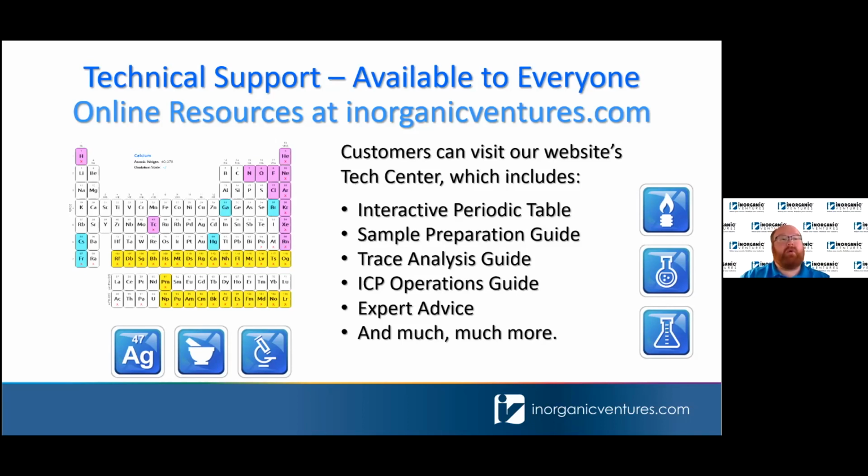But the gold, even gold in nitric has chloride in it. So be mindful of that. There's no gold out in this world that doesn't have chloride attached to it. It's one of those precious metals that just doesn't behave without it. With the bismuth, just increase the HCl and see if that helps. I know when we're doing very low level bismuth, like 1 to 10 ppb, that level will actually stick to the tubing, and that's even with the syringe drive system that doesn't use PVC. But when you use HCl, it seems to help it.